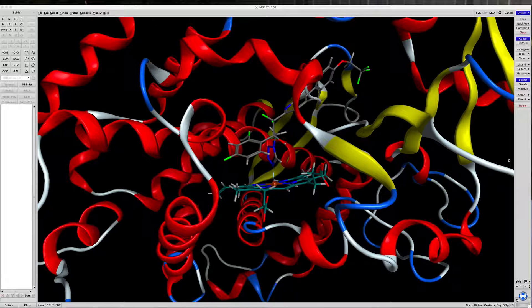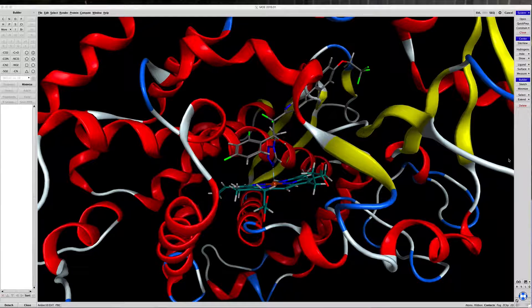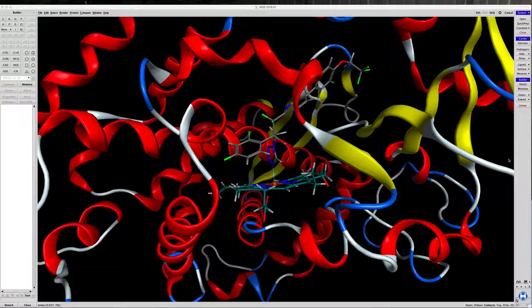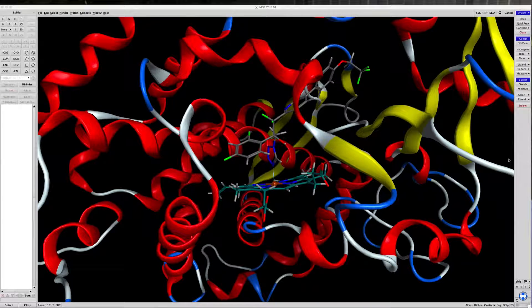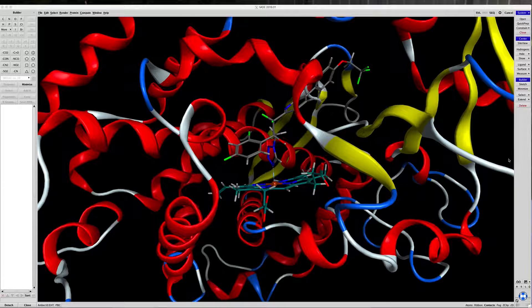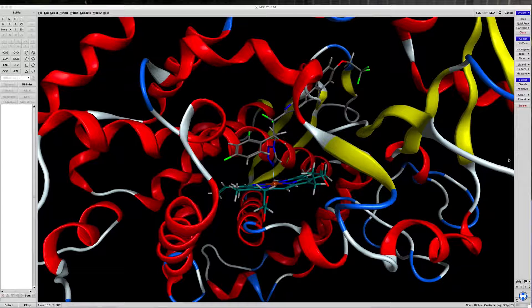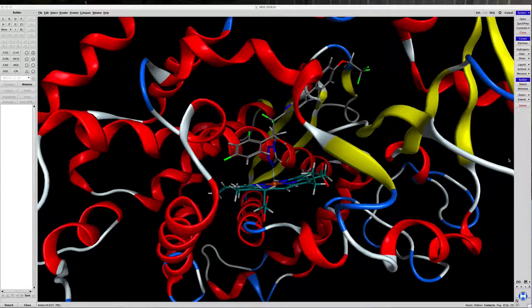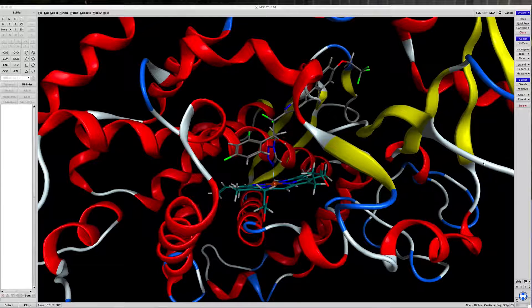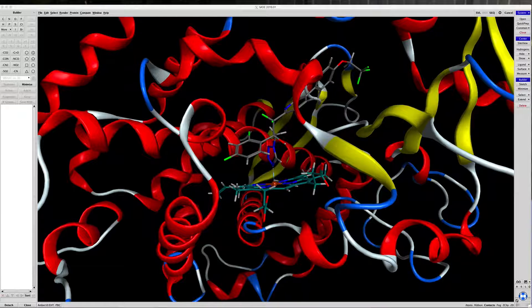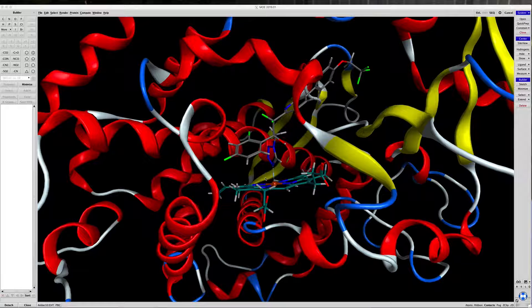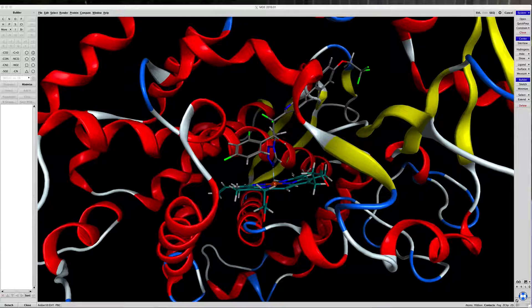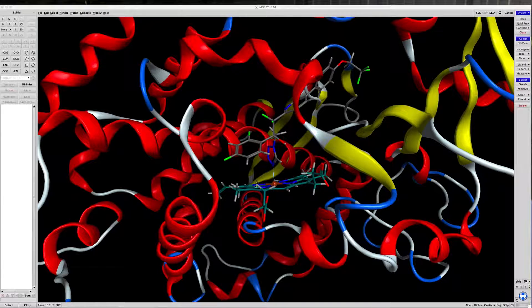You'll see the main Moe window is full screen, and everything we will do will derive from this Moe window. A self-docking is when you use the crystallization ligand to do a docking into the crystallized protein. You'll also note that this protein looks a bit different from the protein we generated and optimized in an earlier video.